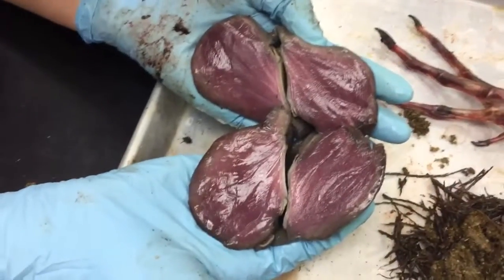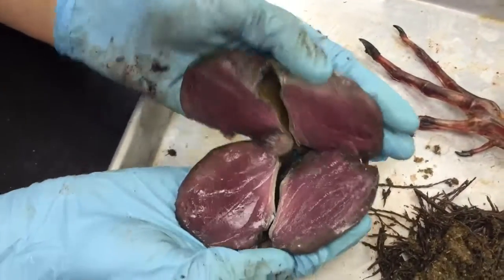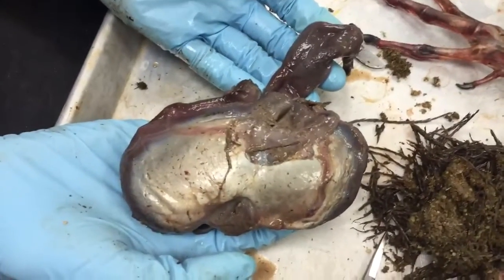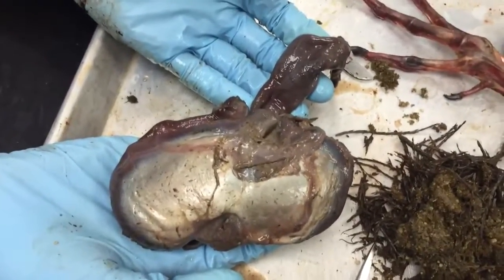Which is pretty impressive. Go ahead and close that up, Emily. And that is the ventriculus — the stomach of a goose.